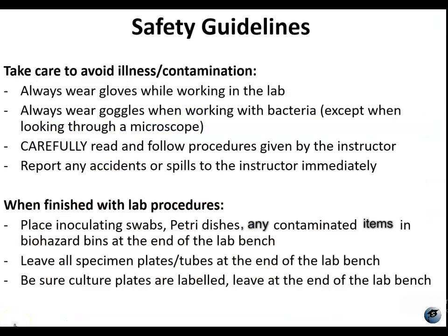Make sure you go through these safety guidelines. Just a couple things I'm going to make sure I point out here. You will be wearing your gloves and glasses, so make sure you have those. Make sure you have your lab coat. If you have any accidents or spills while you're in lab, obviously you want to make sure that you notify your instructor immediately. Any kind of swabs or anything that needs to be disposed of, make sure that you know where those go. And if you don't know, ask your instructor. Anything that needs to be incubated, make sure it's labeled properly with your section and table, and leave those at the end of the bench at the end of class, and your instructor will handle those.